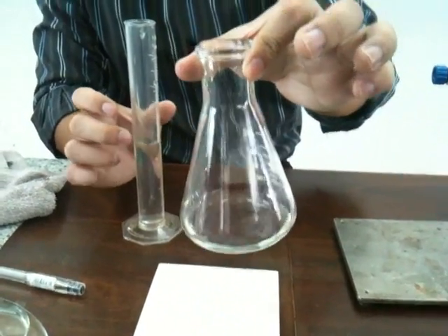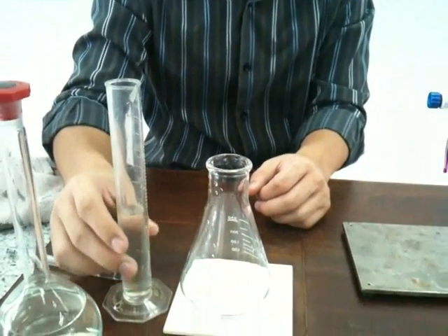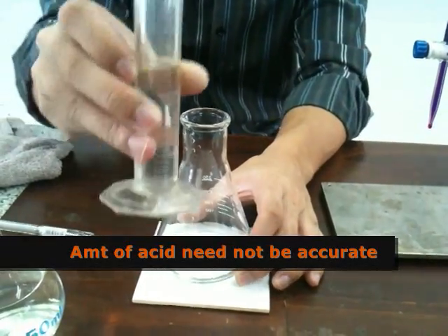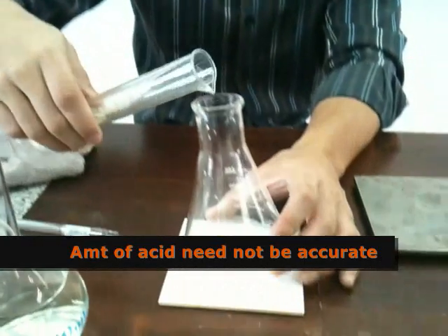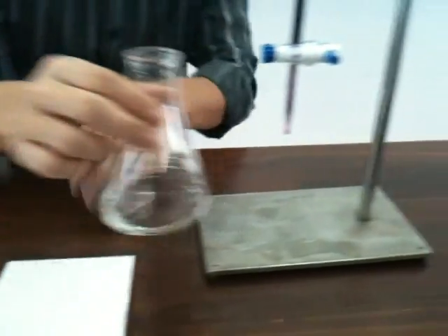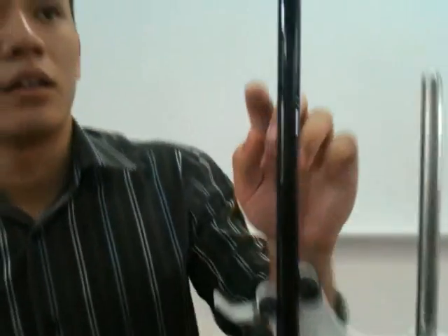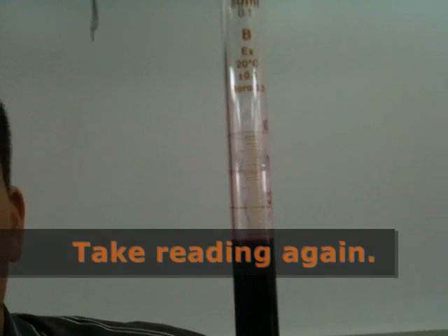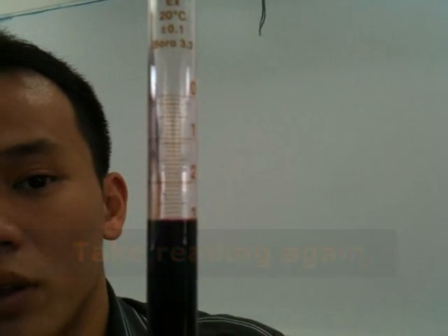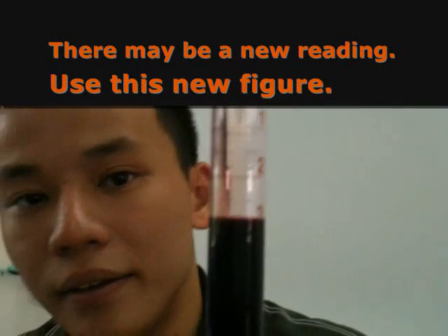After you've pipetted out 25.0 cm³ of your solution, you need to acidify it with 20 cm³ of your H₂SO₄. This is just a rough amount — you may not be accurately at 20 cm³. Now you're ready for the next step. Check the top level of your KMnO₄ burette. In this case, it's around 2.9 cm³.